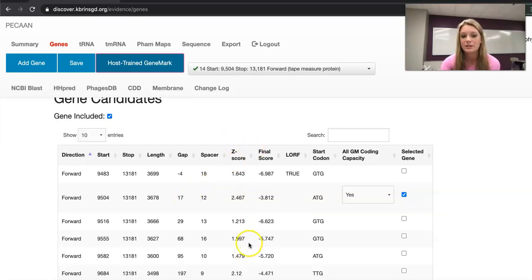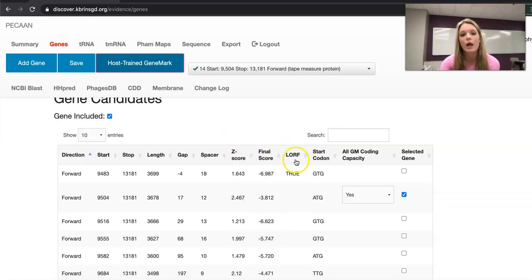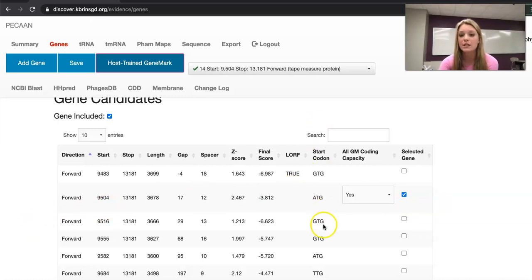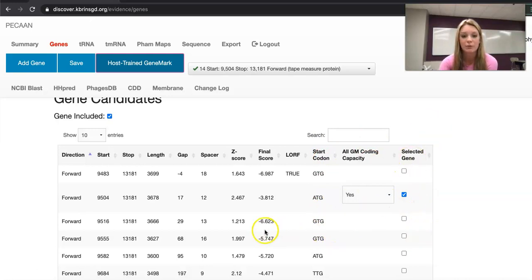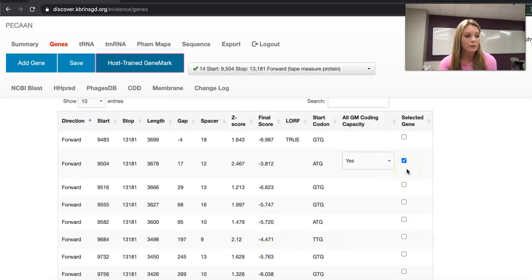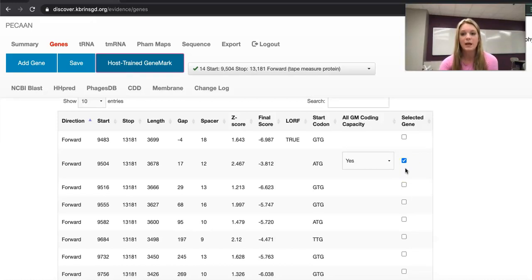This column shows the z-score, the final score, and then LORF stands for longest open reading frame. In this case the gene that we have selected, start 9504, does not have the longest open reading frame. We also see in this column the start codon and if it has coding potential and whether or not we've selected this gene. Since the gene that is selected is the gene with the check mark, this means that all the information on the rest of the page is based off using this gene.